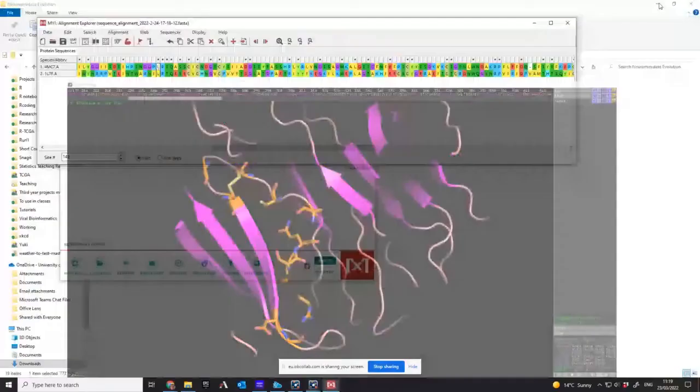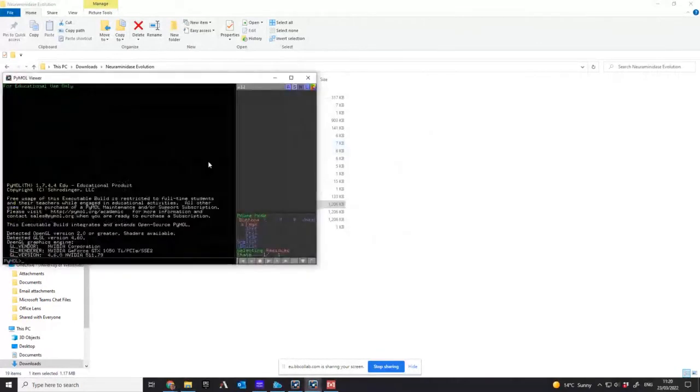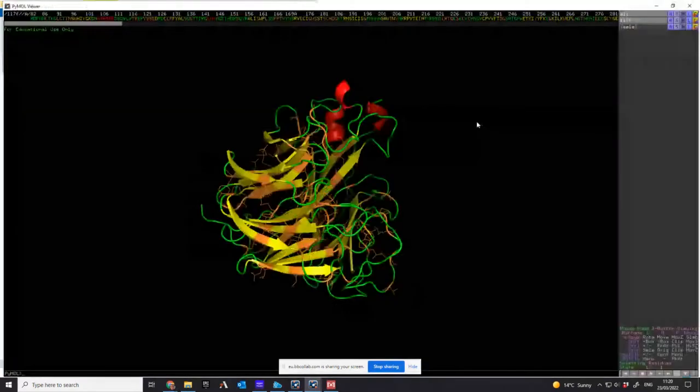Right. So to save myself time, here's one I prepared earlier. Oops. So that was the standard.